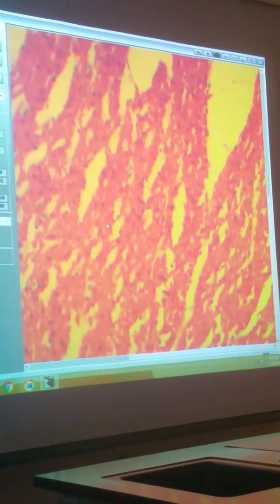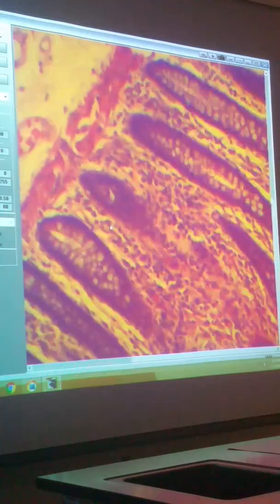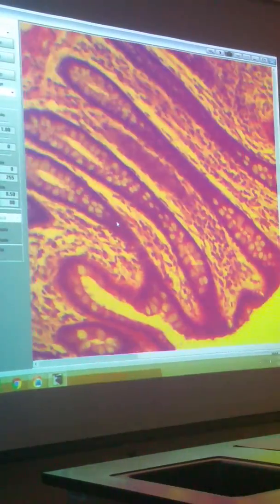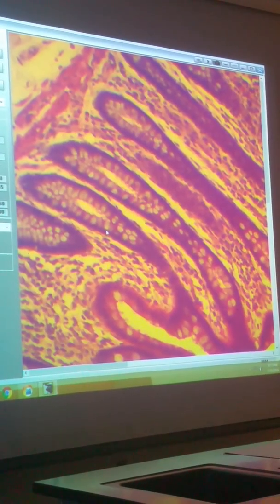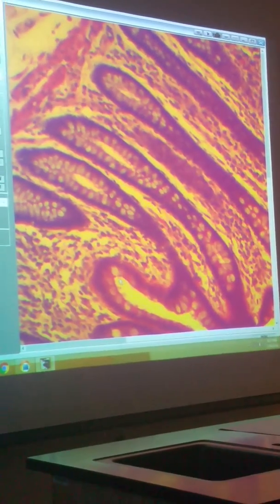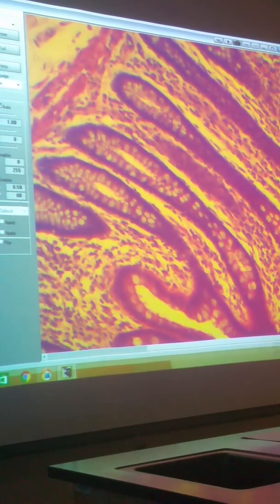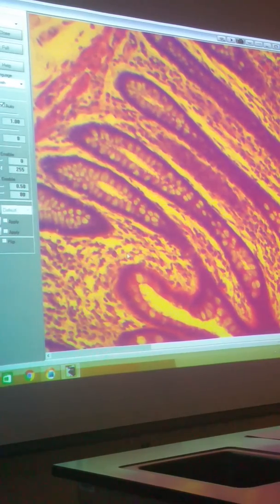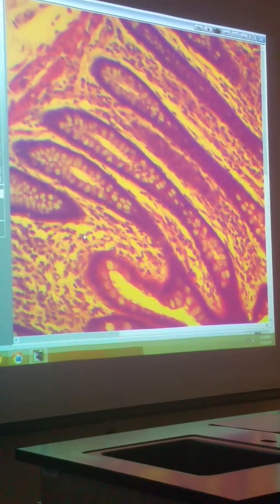Can you show the intestinal crypt? Is it in between the simple columnar cells? Now remember again, the crypt is an invagination of the mucosa. So, for example, all of this right here will be considered the crypt. It's where the mucosa invaginates and goes down into the lamina propria. We say that is the intestinal crypt.